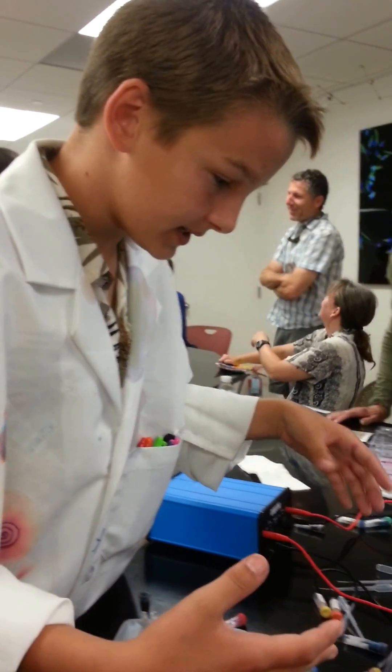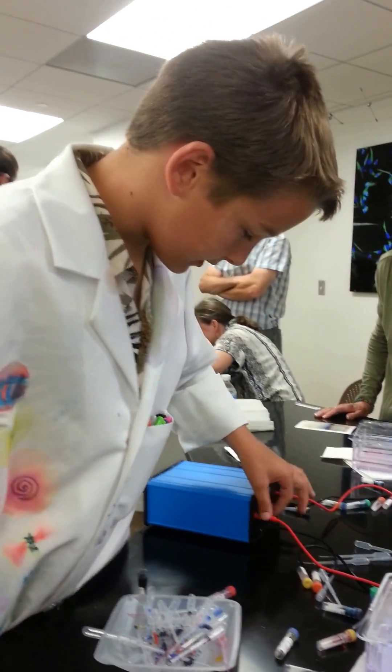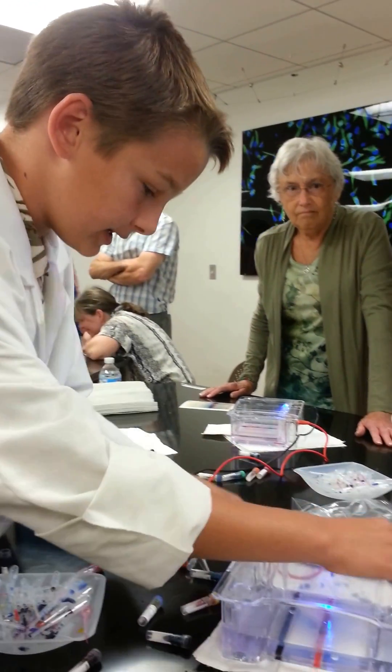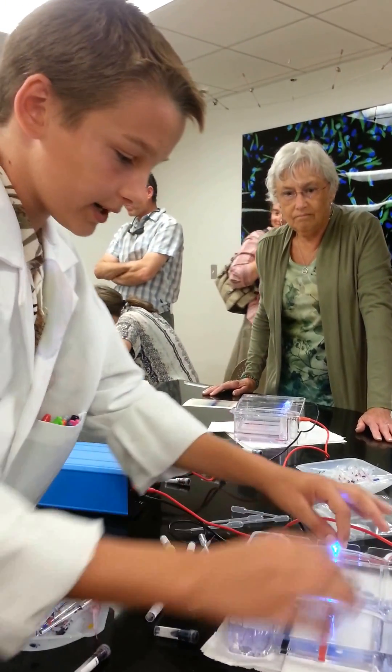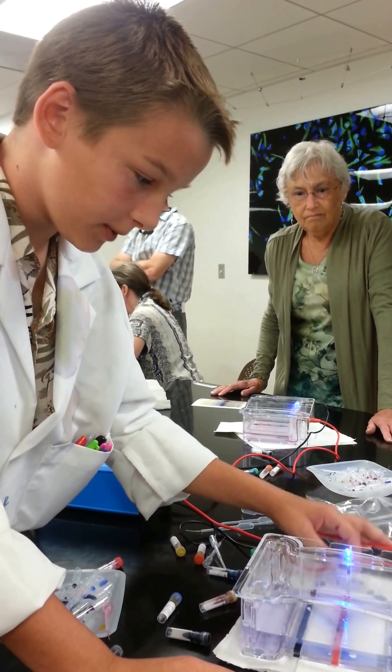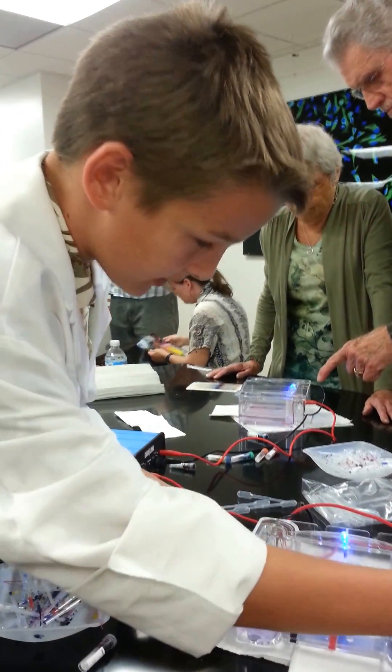What's happening right now is the electric charge from this is going through these wires. The positive is red and the negative is black. It's going through the wires here, which also powers the light bulb so you can tell it's on. It's going through these, going down the wires, going through the magnets.